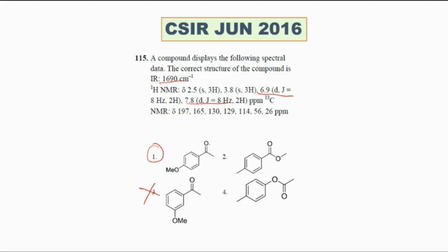So you have 2.5 and the next one. So you also have a 2.5 here, 2.5 here. This is also 2.5. Another one is the 3.8 value, ma'am. So methyl group attached to a heteroatom, ma'am. Yeah, this is also almost 3.84. So either way they are the same, we can get confused here between these two. They're almost close, is it not? Yes, ma'am. So this is also 3.8. This is 2.3, and this can be also 2.3, and this can be also 3.8. Then how will you argue?